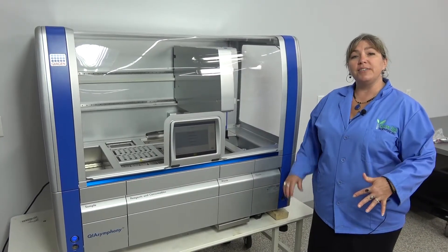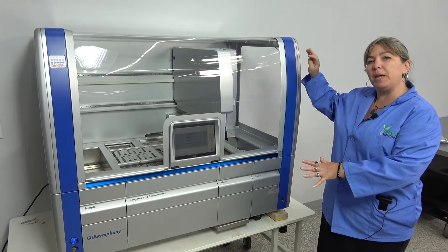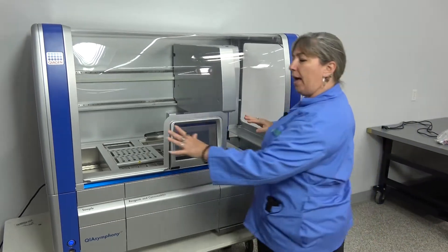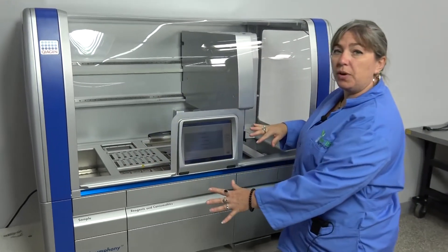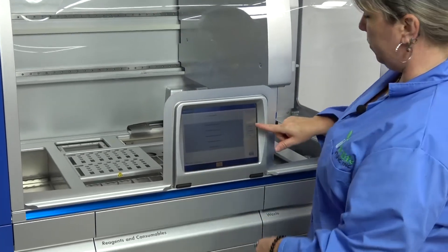Hi, I'm Lori, and we're at New Life Scientific, and we're taking a look at the Kaia Symphony. This instrument is made by Kaigen. We don't have samples or reagents right now, so I'm going to run it through an initialization so you can see how it moves.